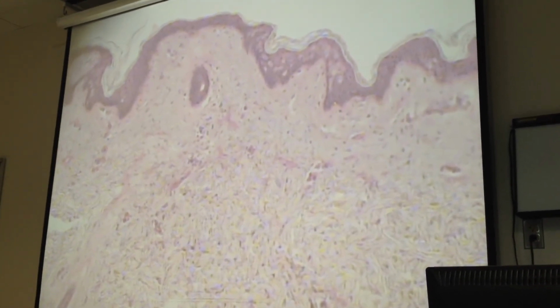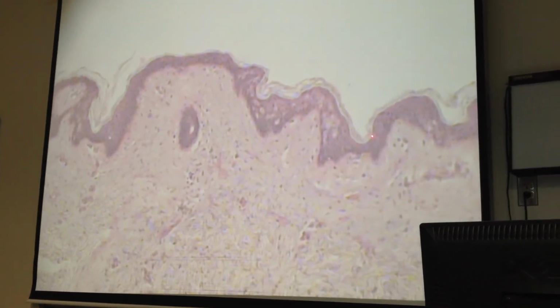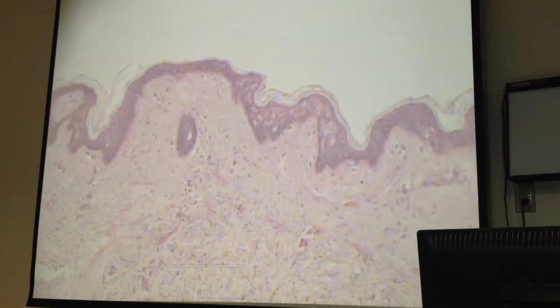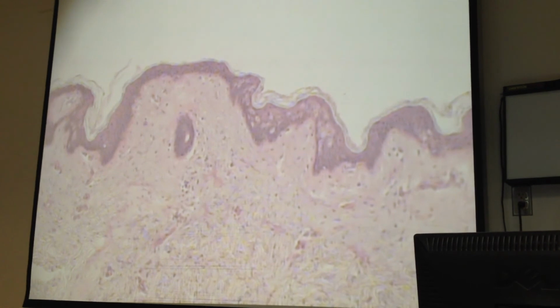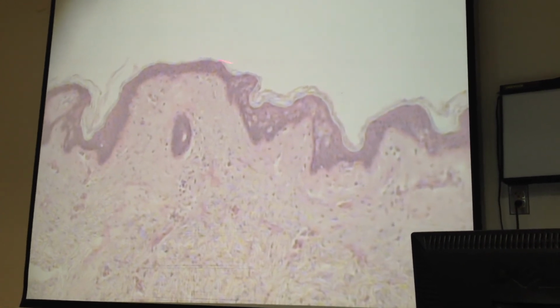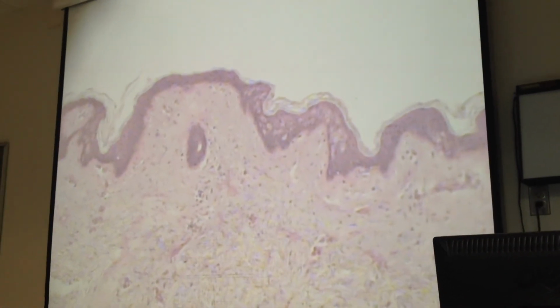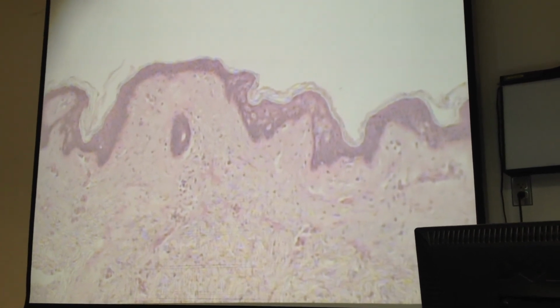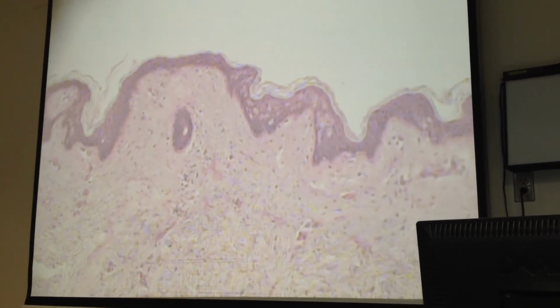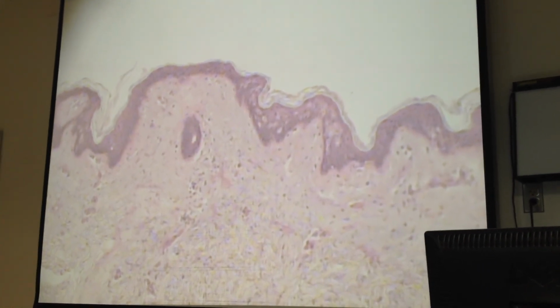What else? Okay, up here we see this wispy sublayer. What's the name of that sublayer? Stratum something. Corneum. Yeah, that's the stratum corneum. Good. It's the dead layer on the top that starts to slough off, comes off in sheets. So stratum corneum is the sublayer. It's part of the epidermis. Okay, I think we got everything on that one. Okay, let's show you slides.